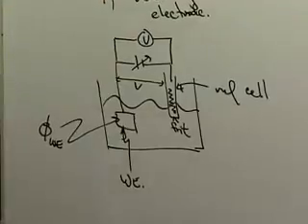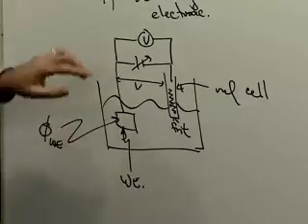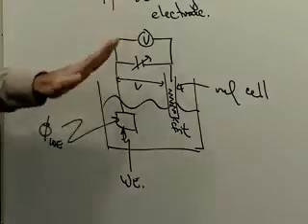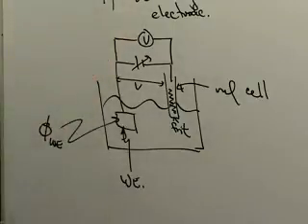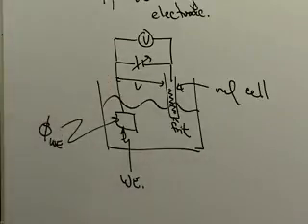So now, let's see, do I have any freshmen sitting here? Good. So what you do is you go and you find a friendly freshman, right? And you find a nice, comfortable stool, right? And you tell the freshman to sit down on the stool. And just while you're doing this experiment, which is only going to take 10 hours, stare at the voltmeter. And anytime the voltmeter deviates from the number that you want it set at, just turn the variable power supply to bring it back to whatever it is.